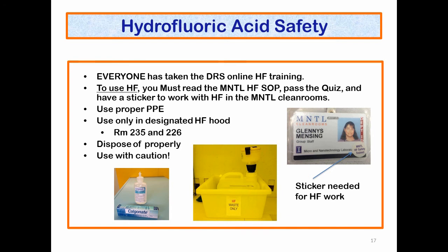We do have calcium gluconate available in each hood. If you suspect that you may have gotten HF on your skin, rinse your skin for 5 minutes, apply calcium gluconate gel copiously, and immediately seek medical attention, either with staff or at a hospital.